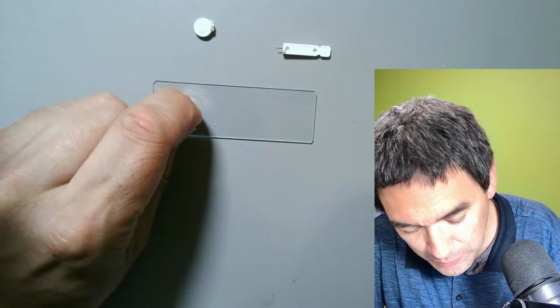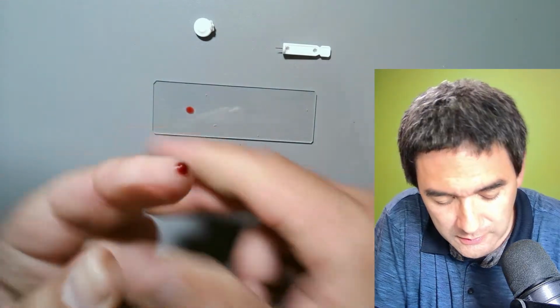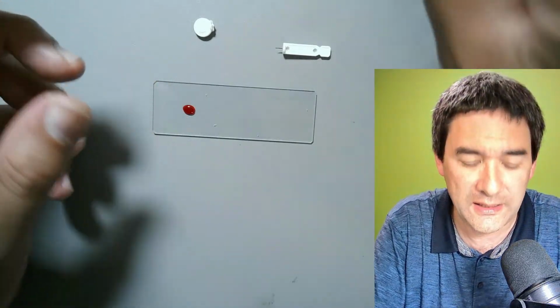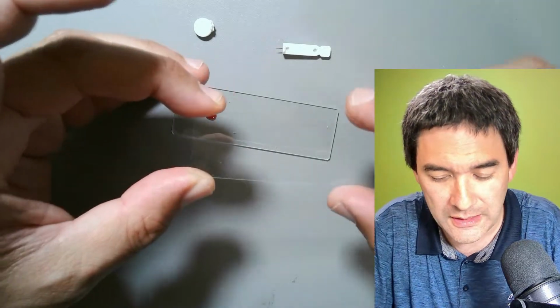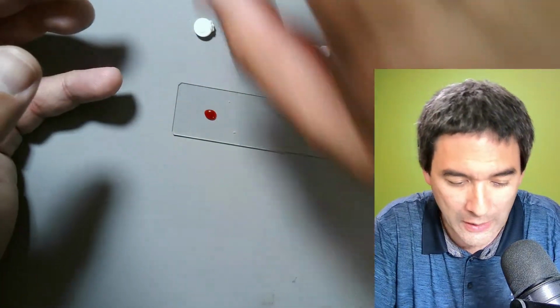And I'm not going to make a blood smear. Normally, if you're in medicine, you now take another slide and you streak it across. I'm not going to do that because I do not want the blood to dry out.